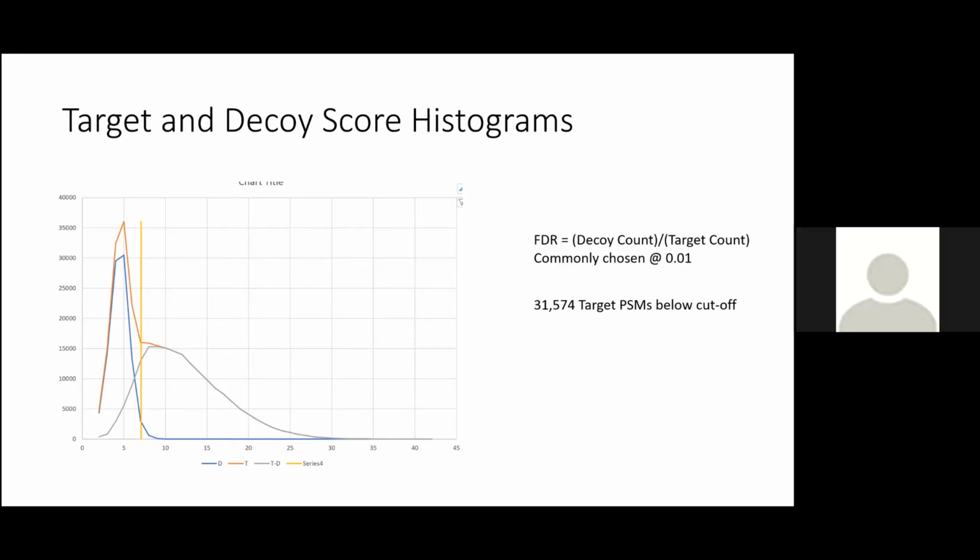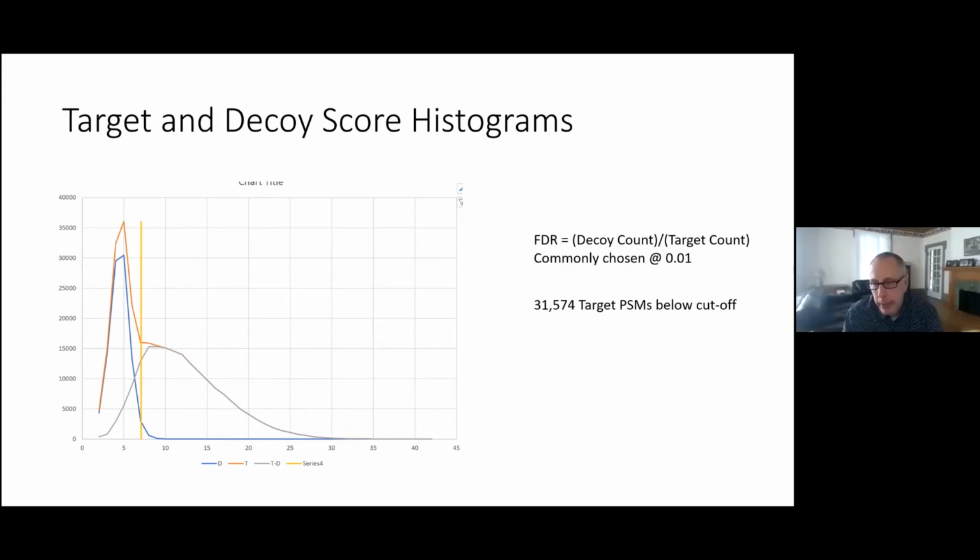So we construct a smaller table, again, of target and decoy matches. And in this case, it's just the best scoring PSM for each one, sorted from top to bottom. Otherwise, graphically, there's no difference, and computationally, there's no difference. It's just a subset of the best matching PSMs.